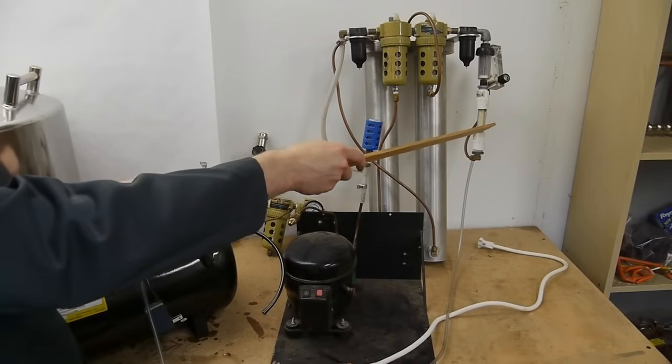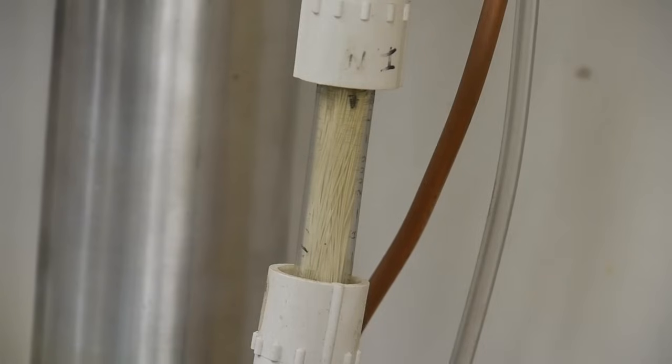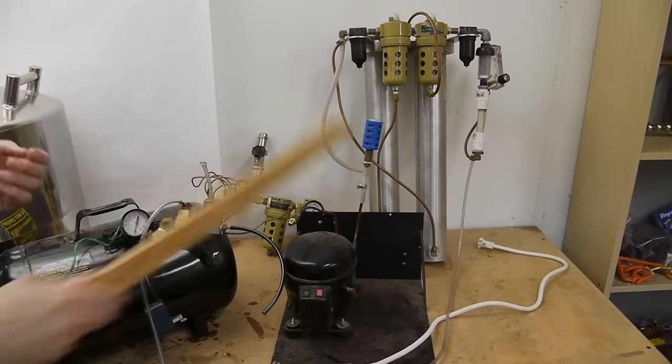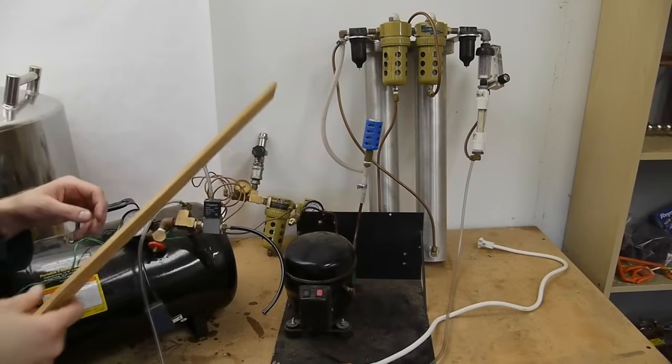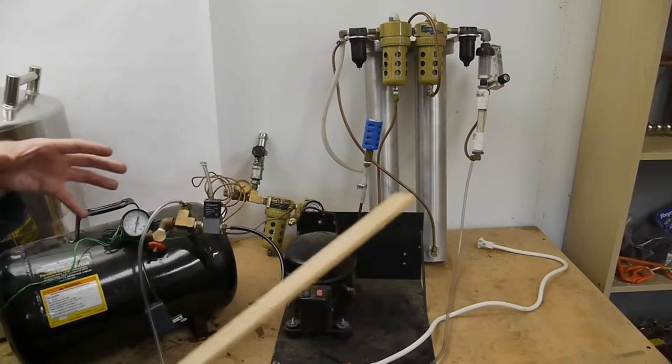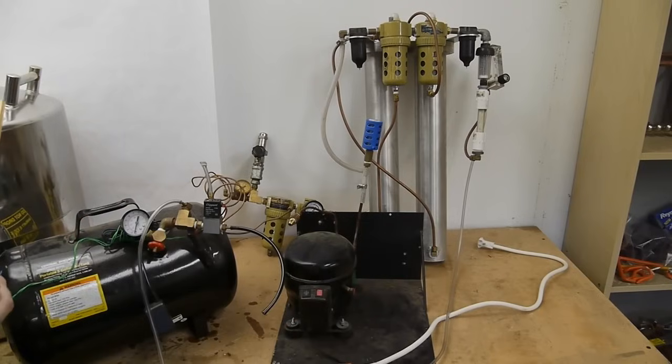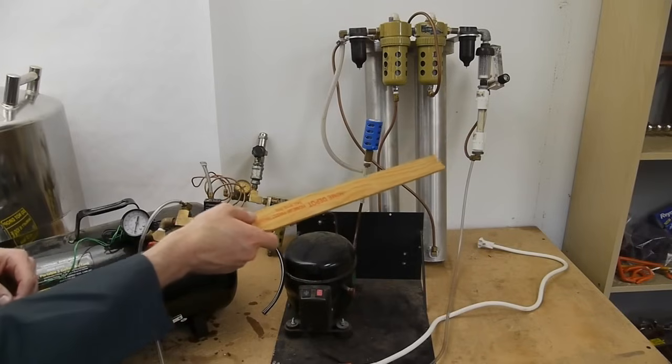Following this we go through the actual nitrogen separation membrane and so this is a really tricky part of the whole system. I've probably spent as long on eBay looking for a nitrogen separation membrane as I did looking for the cryo cooler which is kind of the heart of this whole system. You can find these industrially and they're actually quite large I mean like a four foot long bundle that's maybe six inches in diameter meant for industrial use but finding them small like this is tricky.